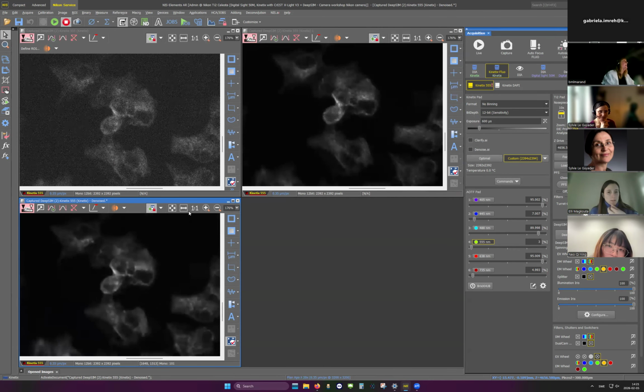And as you can see here, the denoised image, if you're looking at the same cell here, this was 8 times averaging, and here we have now the same quality, the same signal, and a really nice background compared with the undenoised, unaveraged images. So that is something that you can do if you still want to have the speed, so you tolerate a little bit of noise in the image. You can always apply a couple of averaging, or you can use afterwards a denoise algorithm.